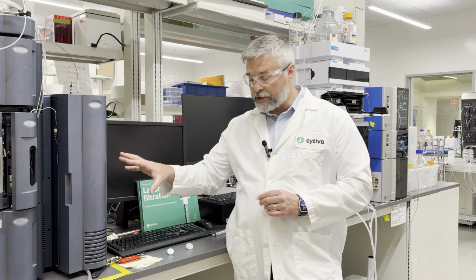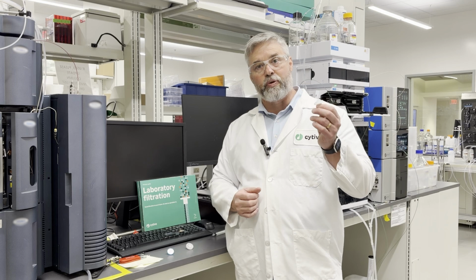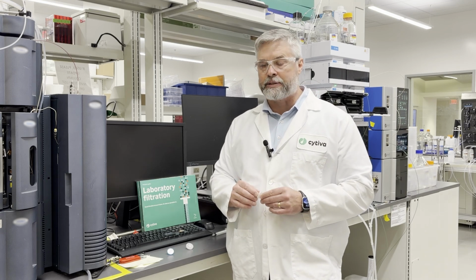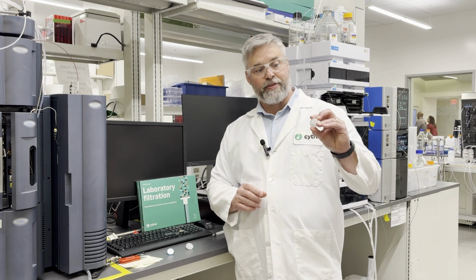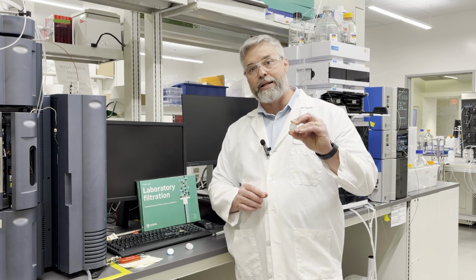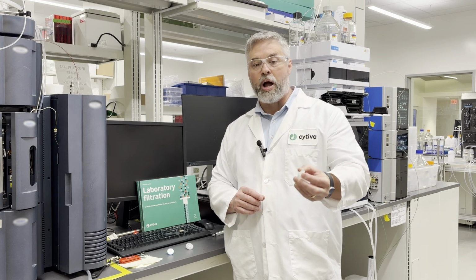Number two, protect your instrument. Your instrument has value. And again, those particulates can be removed with syringe filters. So it's best practice to filter your samples. But the most important reason that we want to filter is that the filter itself should not introduce any background contamination of PFAS containing molecules.